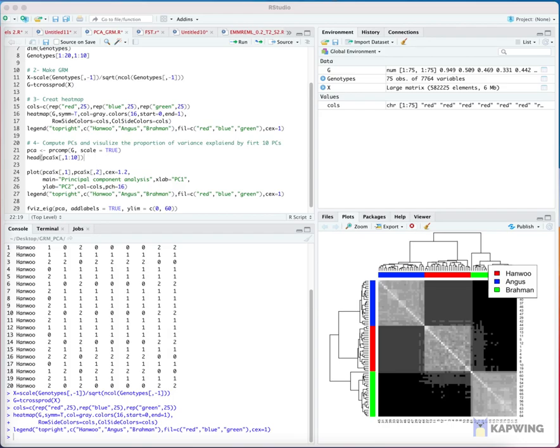Step 5: Perform a principal components analysis on the genomic relationship matrix and obtain all PCs using prcomp. Visualize the distribution of individuals across the first and second PCs, and the scree plot of the proportion of variance explained by the top 10 PCs.